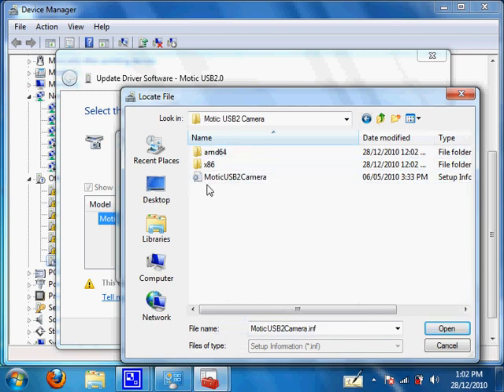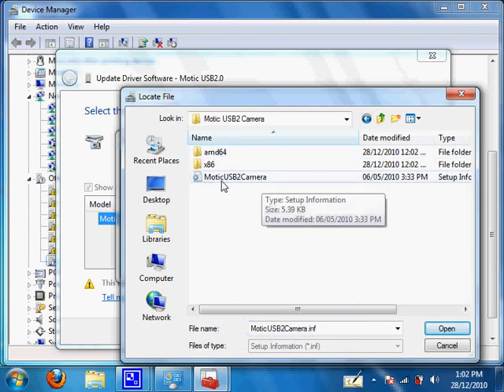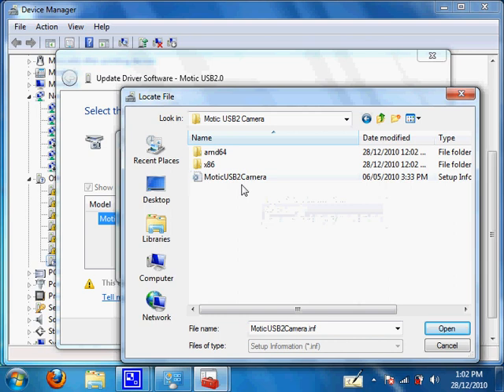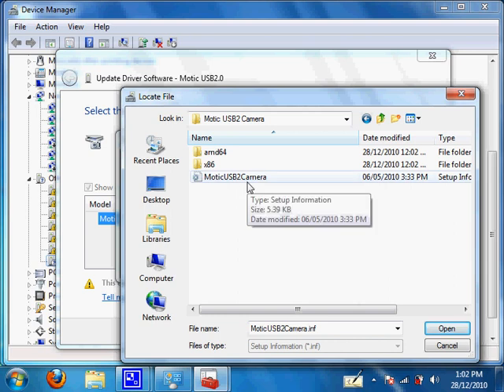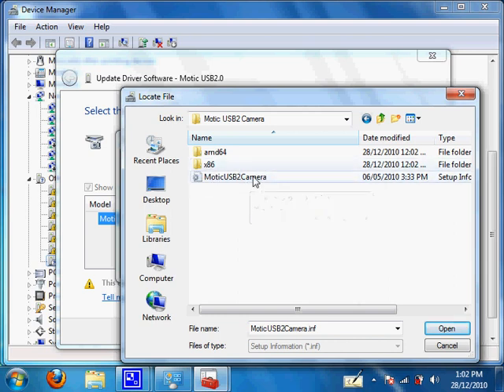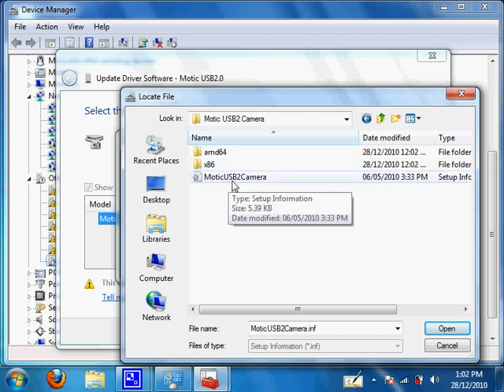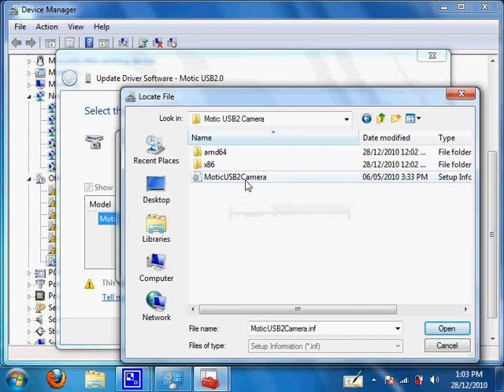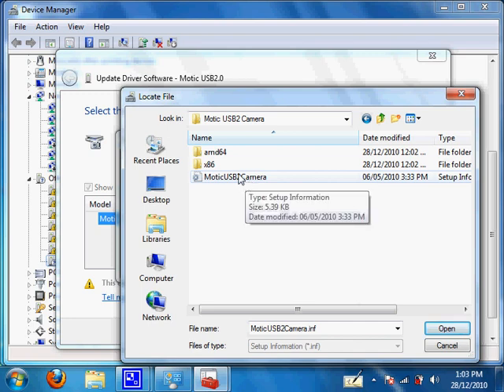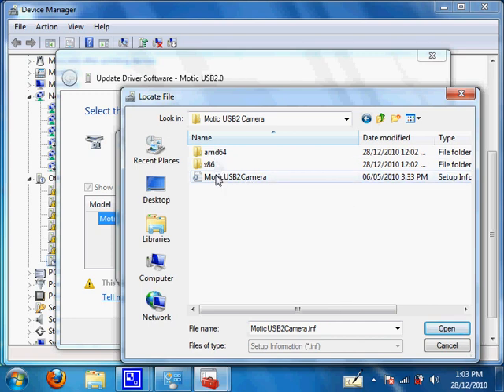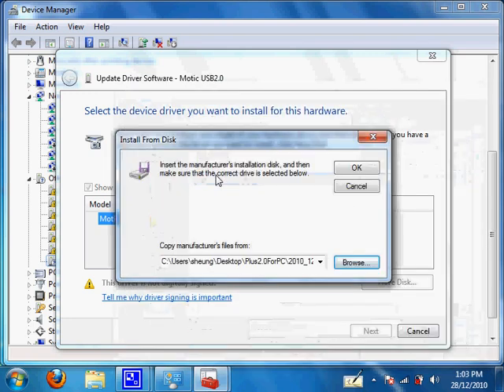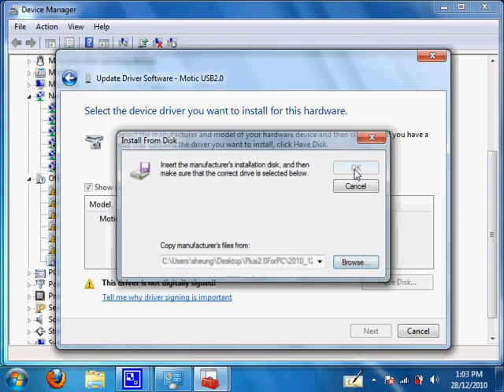Once you get in, there should be only one file you can click on. In my case, it's Motec USB 2.0 camera. It may not be the same for you. What's important is that there's only one file you can click on. Double click on that and then click OK, and then click Next.